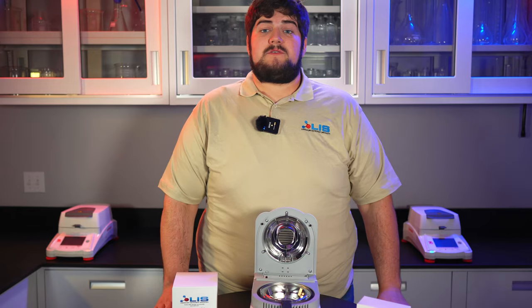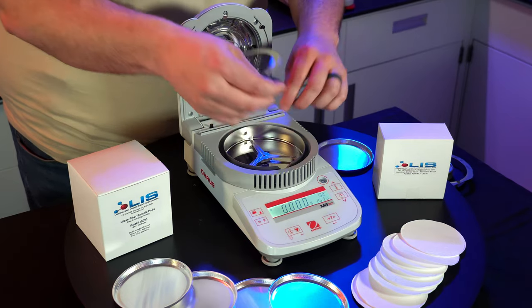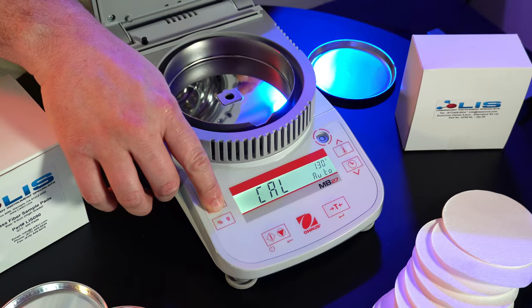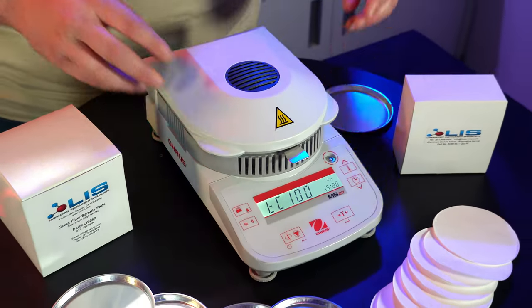Now to calibrate the temperature sensor, we'll be calibrating the two set points: 100 and 160 degrees Celsius. Remove the pan support and press and hold the calibration button, letting go when cal is displayed. Insert the temperature calibrator and close the lid. It will automatically begin to calibrate the temperature sensor at 100 degrees. After 15 minutes, you will be asked to verify through the vent to see if the temperature sensor on the calibrator matches 100 degrees. If not, press the up and down arrow keys to make the instrument match. Once it has matched, press the tear button or enter button to accept that calibration set point.